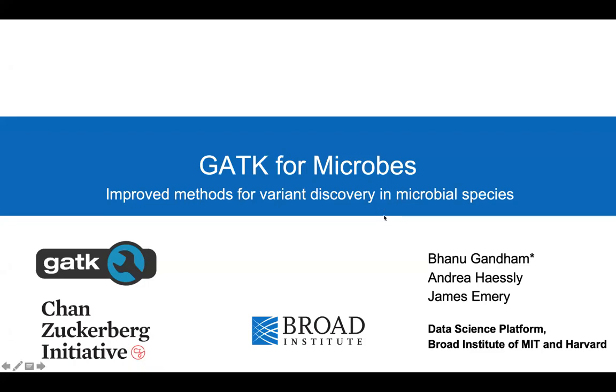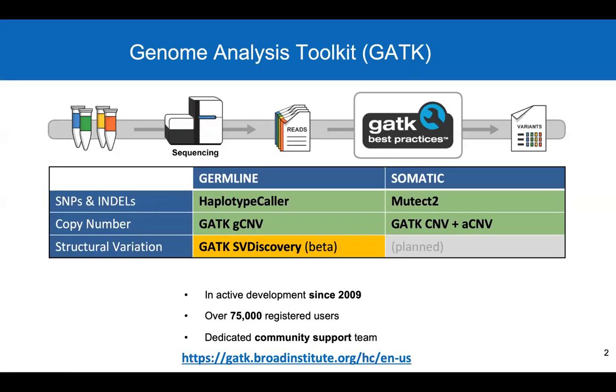Hello, everyone. In today's talk, I will share with you the GATK-for-Microbes project, which is an improved GATK method for variant discovery in microbial species. GATK stands for Genome Analysis Toolkit. It is an open source software package with over 240 tools and more than 75,000 users. It is used to discover variants after reads come off the sequencer.